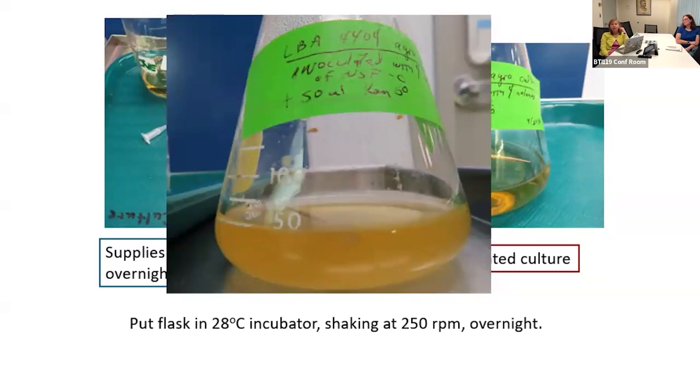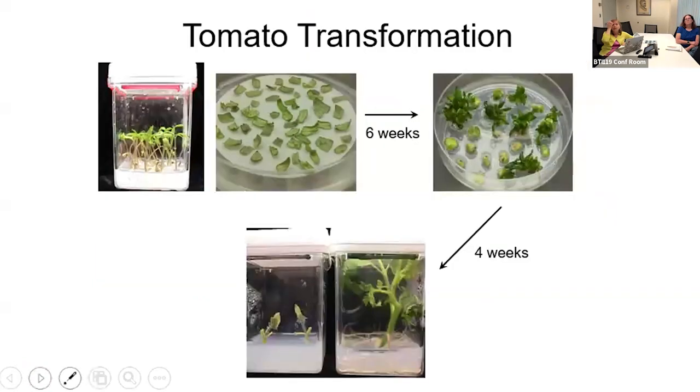And then the next couple of slides are just in case you're curious about how long this all takes. So we start with those germinated seedlings. We have our cotyledons. You can see in these cotyledons, that's the top of the cotyledons down. That's the pre-culture period. And then after we do the transformation, they go to medium, bottom down. And then you can see that we have these on, this is actually a kanamycin selection. And you can see that we've got some transformants starting there.